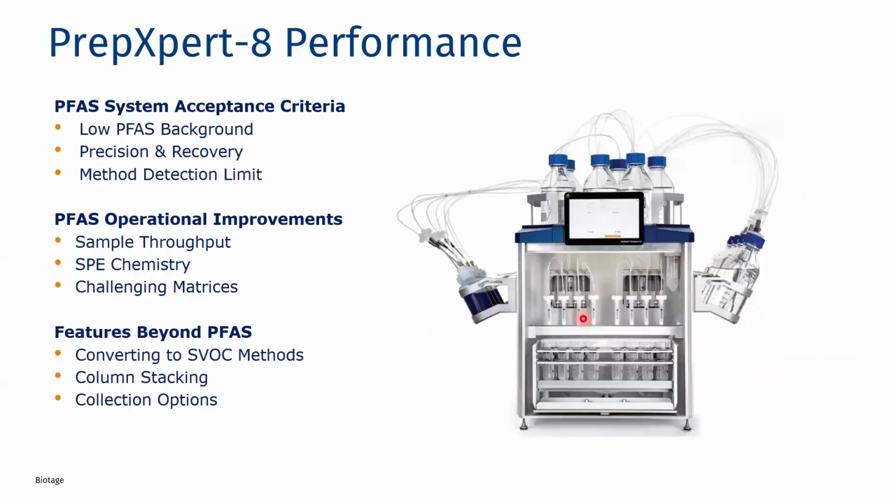All right, so we talked about the operational improvements: sample throughput, SPE chemistry, and challenging matrices on the system. Now I want to go into the features beyond PFAS testing.